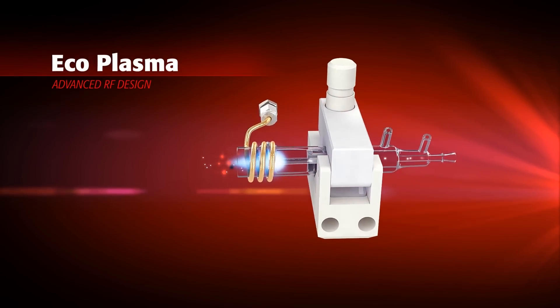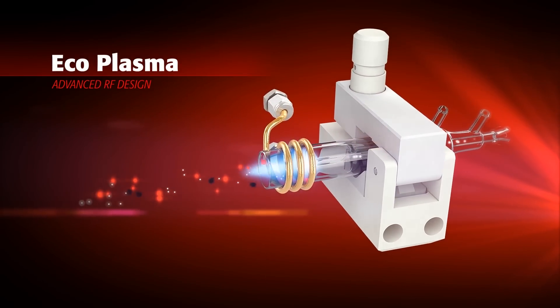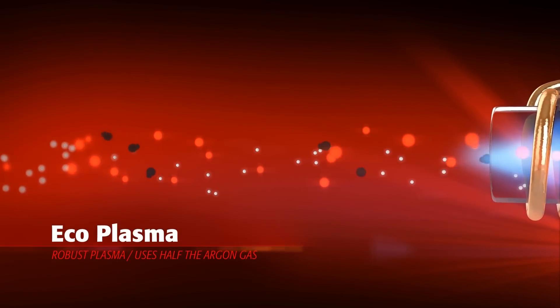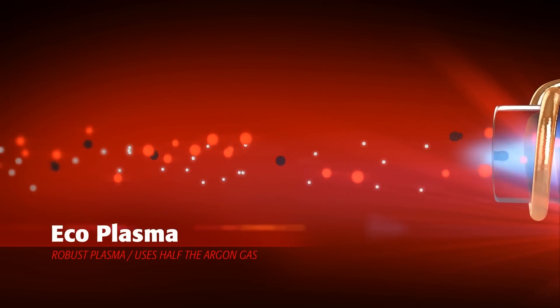Requiring less than 10 liters per minute of argon gas, the PlasmaQuant-MS achieves more than five times the sensitivity of leading quadrupole ICP-MS systems.